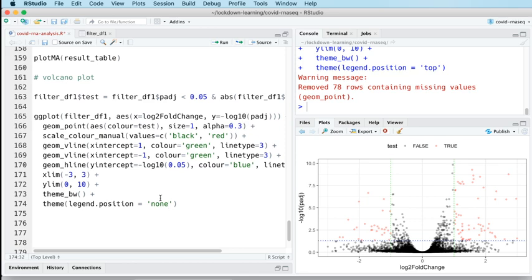Actually, the best way to take this plot and make it useful like that is to turn it into an interactive plot. ggplot by default just draws flat graphics. It just draws you a graphics object that you can't then interact with. But there's a relatively simple way to turn a flat ggplot plot into an interactive plot, and that's using a package in R called ggplotly, which I will just quickly do now because I hadn't really thought about doing this, but it's quite a good idea.